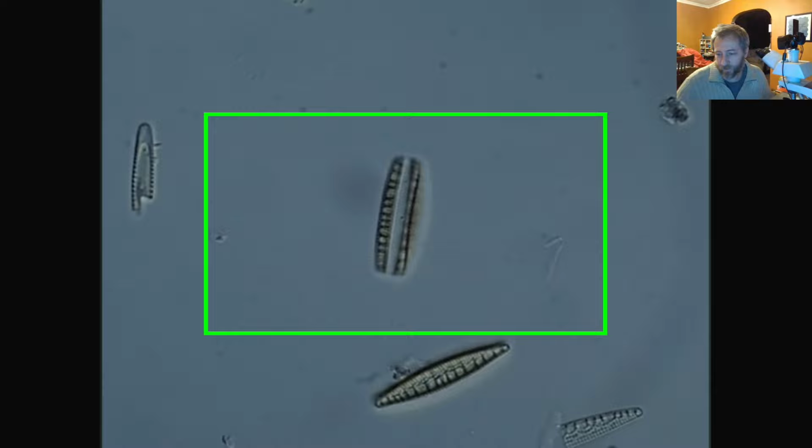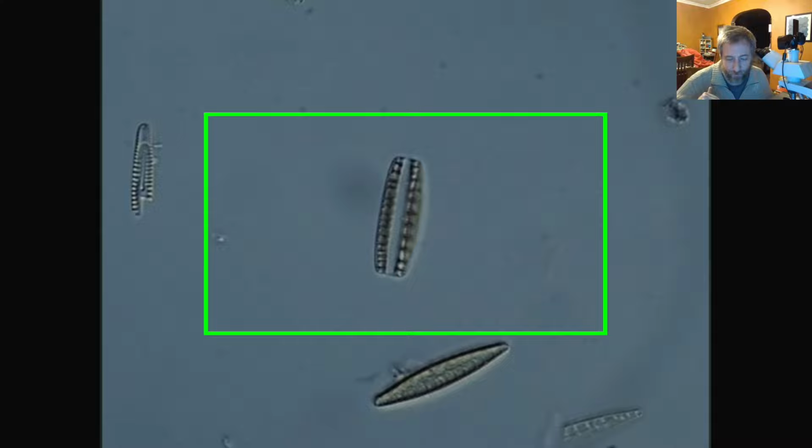Like this, oops, this is not a perfectly square shape. It's a rectangular prism. And so the diatom basically has a similar thing. The one in the middle is like this, and the one we're looking at the top is basically like this. So it looks a little different. But you can actually see both valves in the girdle view, where you can only see one valve at a time in the valve view from above.